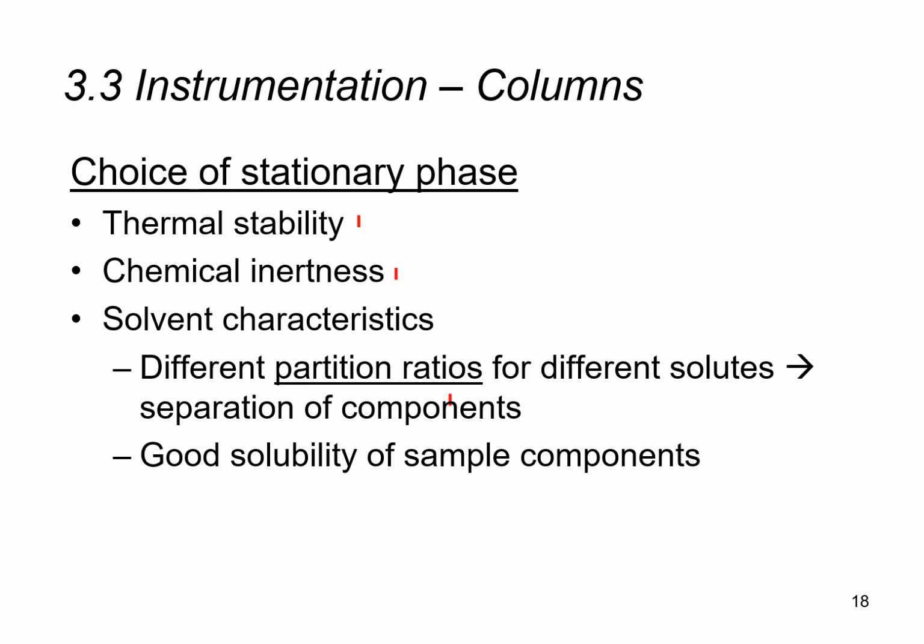Chemical inertness. Now the insides of these columns, that polymer coating that we were talking about, the stationary phase, must be inert, as they cannot start reacting with various gaseous molecules that are passing through the column. Right? So imagine if we inject a sample and the various chemical components start flowing through the column and start reacting with the inside of the column.